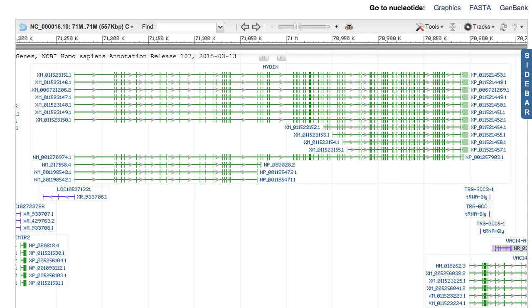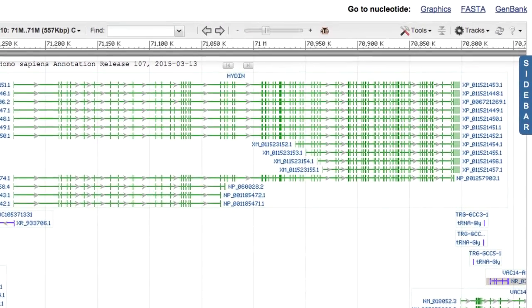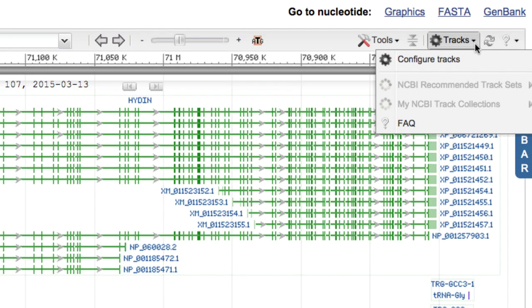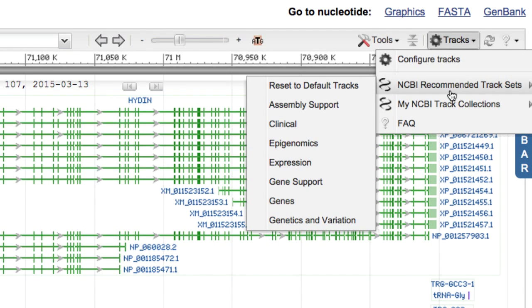This video introduces NCBI recommended track sets. These are NCBI-provided assortments of tracks that are commonly viewed together. With one click, you can tailor the graphical display to meet a particular need.